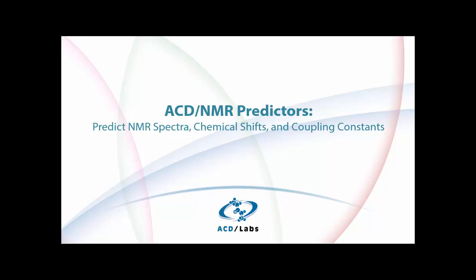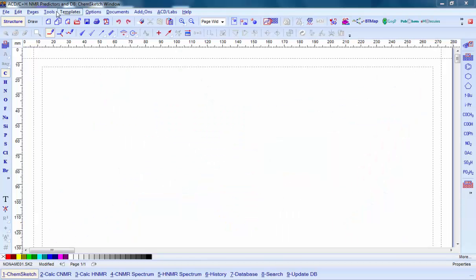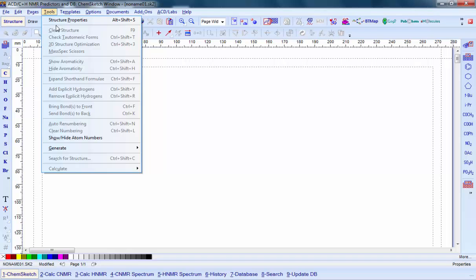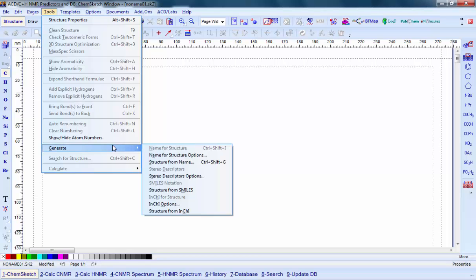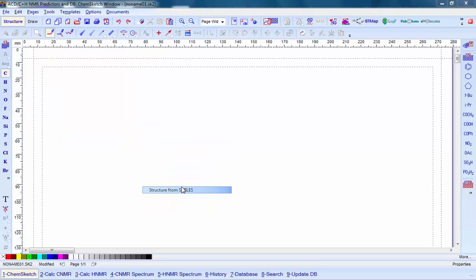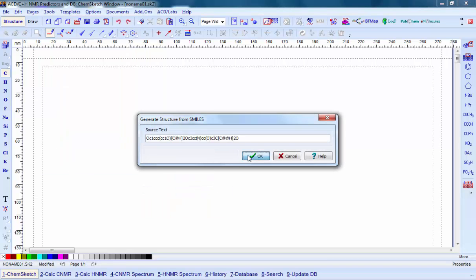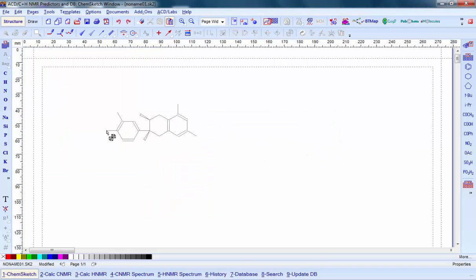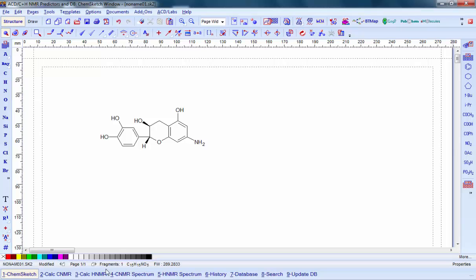Let's have a look at the software in action. Structures can be input in a variety of ways: using the ChemSketch interface by copy-paste or by drawing the structure, or through other methods such as the chemical name or InChI description. We can also input a structure through a SMILES string as shown here.